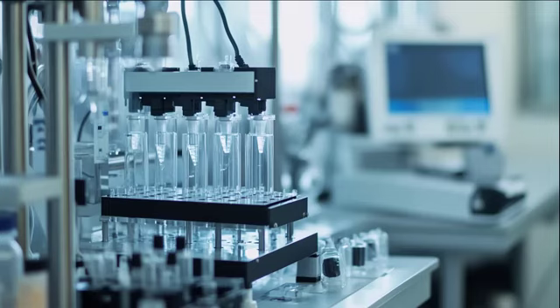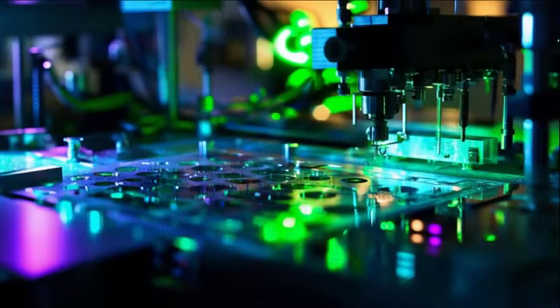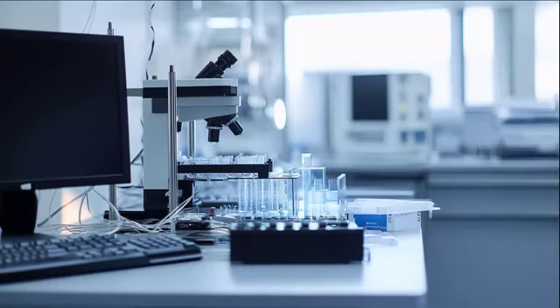Digital microfluidics manipulates droplets on an open surface using electrical forces rather than physical channels. For example, electrodes arranged in a grid can move, merge, or split droplets on a chip, much like a digital chessboard where each move is precisely controlled by electrical signals.